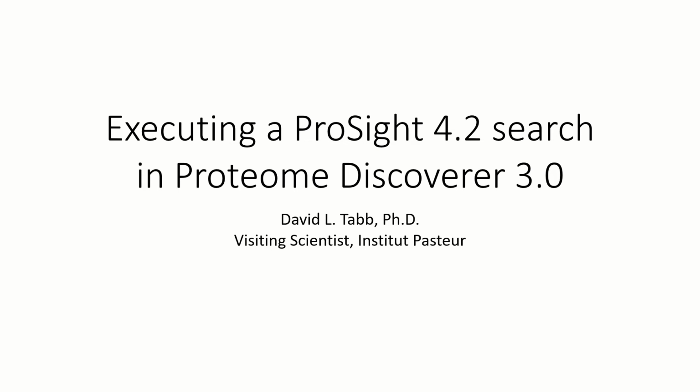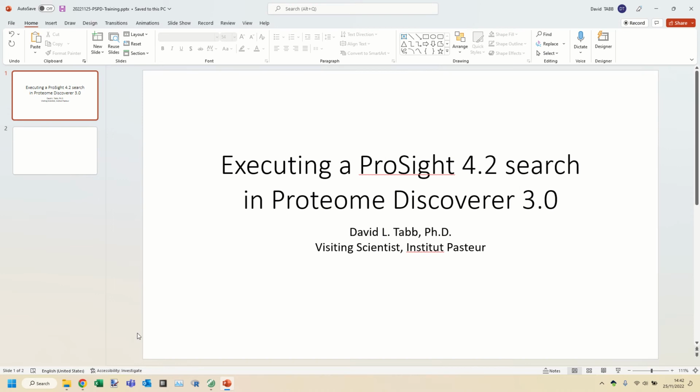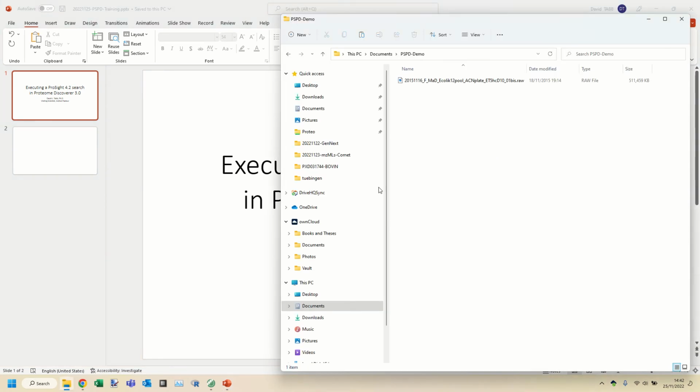I am currently located in Julia Chameau-Rooc's team up at Institut Pasteur, where I've had a lot of interesting experiences working with protein identification. And I really felt it important that I take a look at this most widely used framework for identification. So we'll be starting with a raw file.